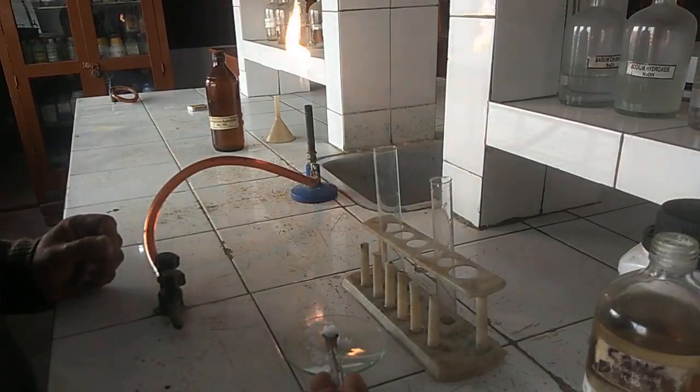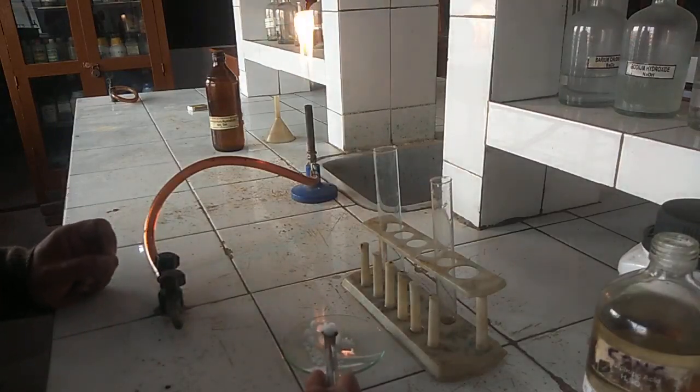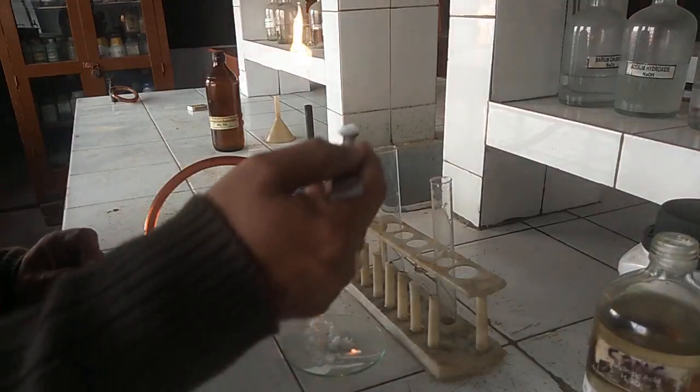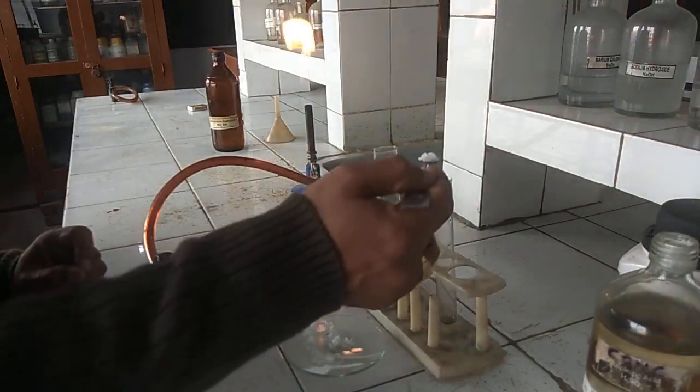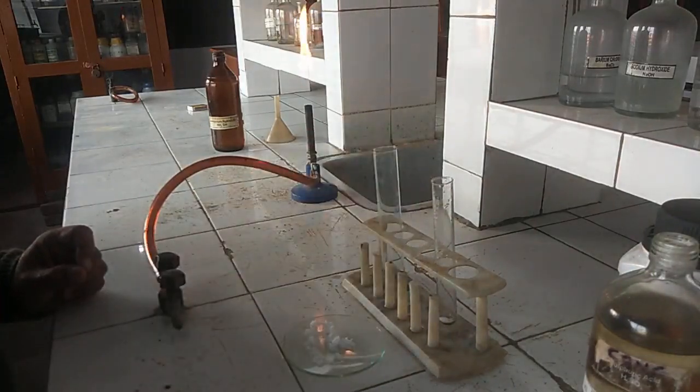Now we will do another test of chloride ion with the help of concentrated sulfuric acid, as chloride ion belongs to group 2 of acidic radicals, and the second group acidic radicals are tested with concentrated sulfuric acid. For this test, we will again take some salt which contains chloride ions in it in a dry test tube with the help of a spatula.